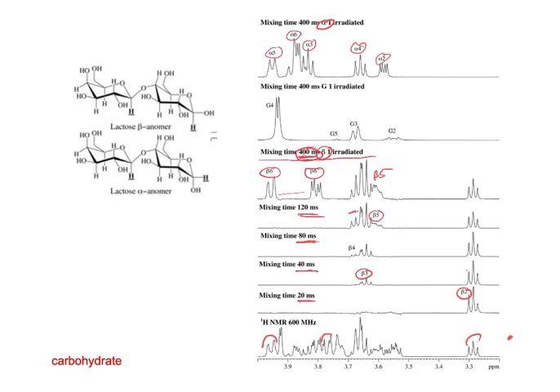And here's the one for irradiating G1, so that's here, with a 400 millisecond mixing time. It doesn't seem like it goes quite as far on this one, though. G1 to G2, G3, G4, and G5 is just coming in, and it doesn't show the G6 yet. But it's a way, again, to pull essentially one-dimensional spectra of individual spin systems.